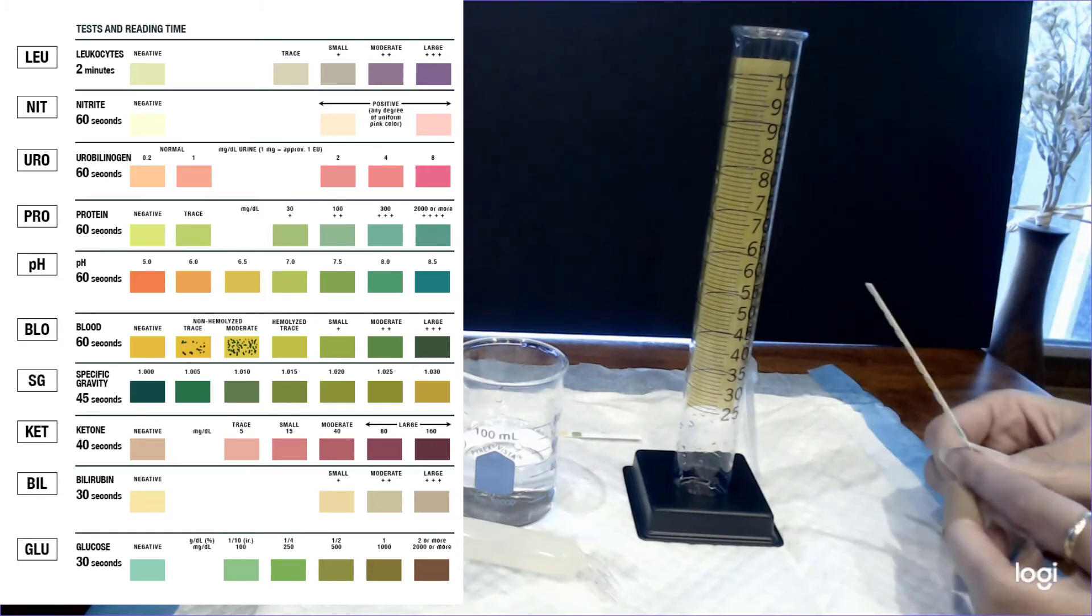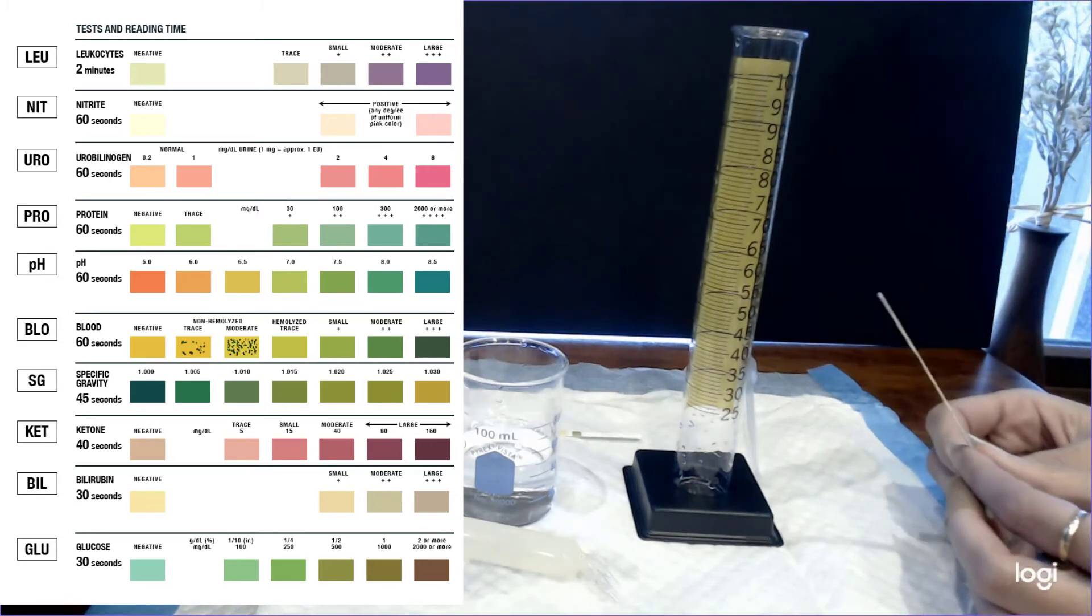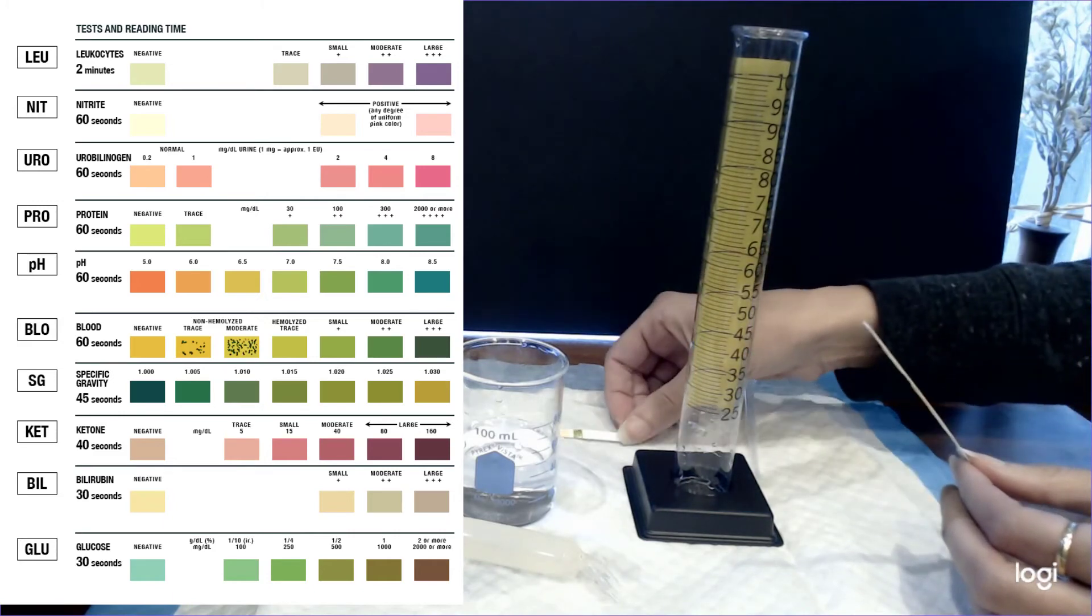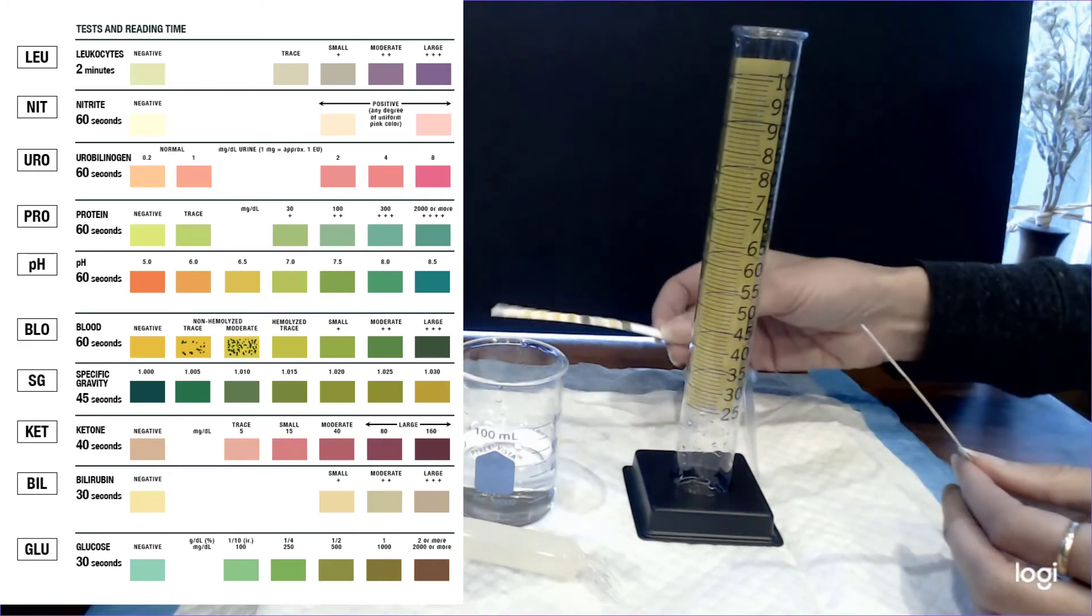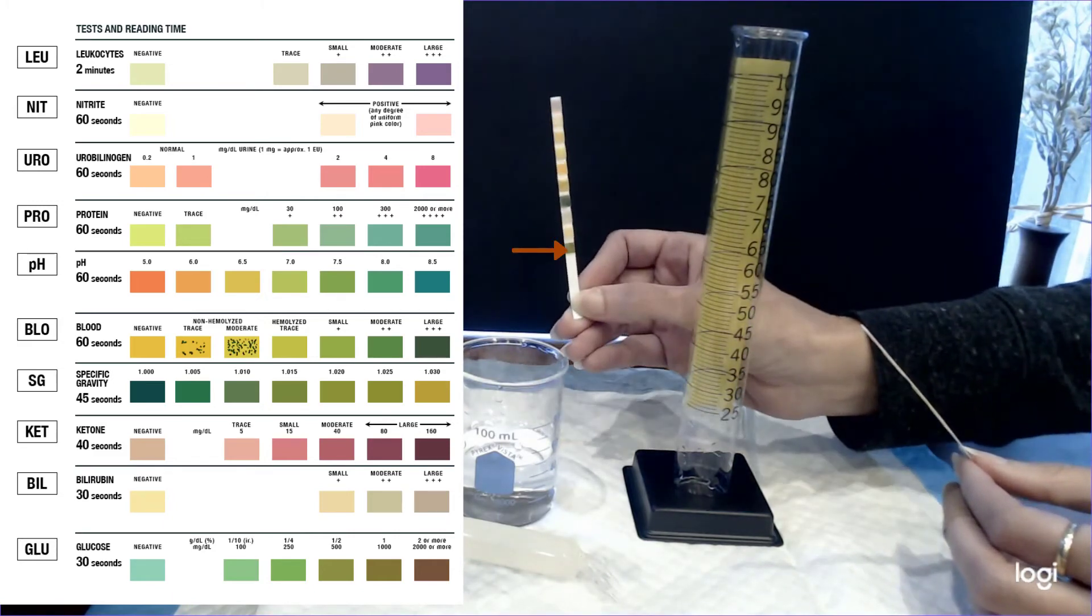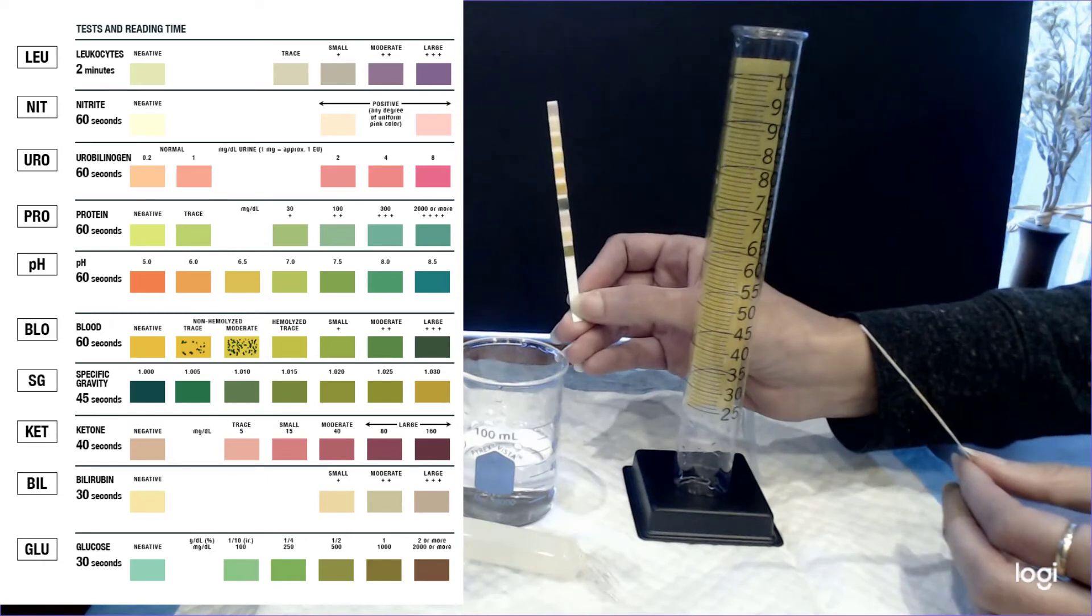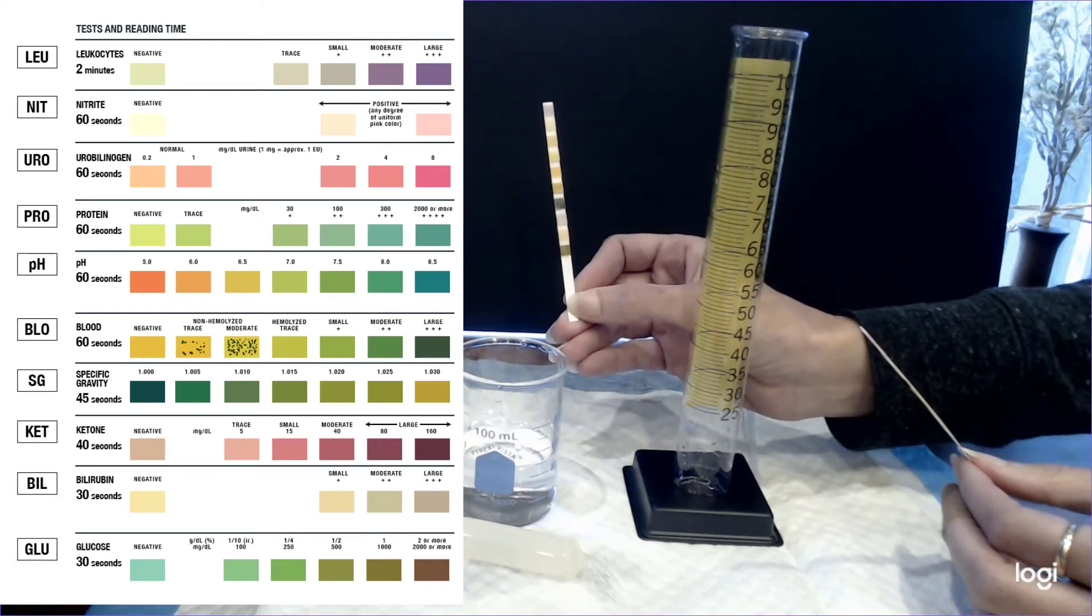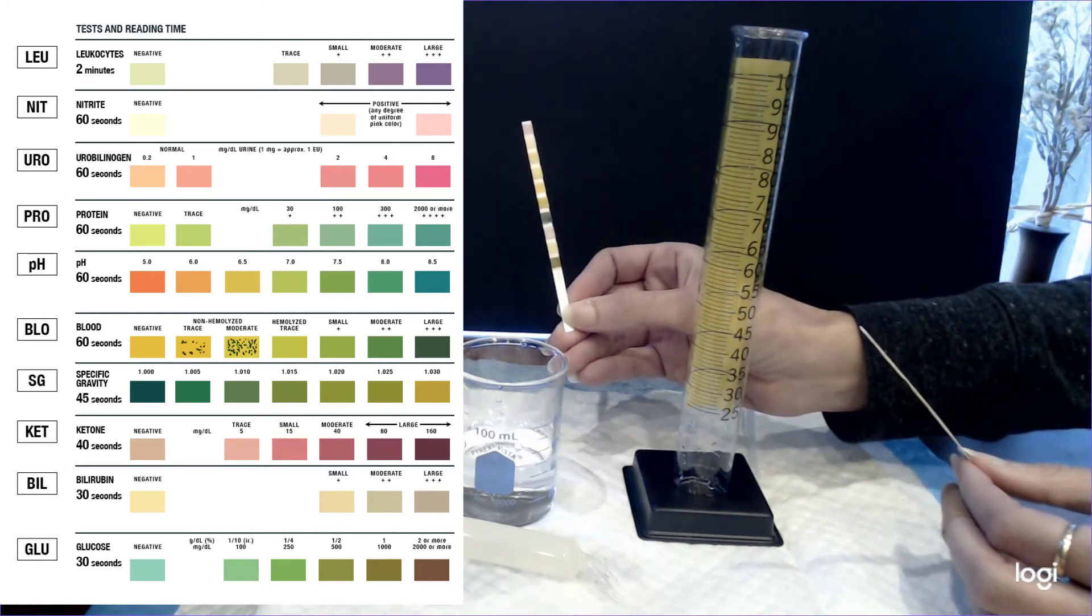The urine dipsticks have ten different things they assess for but the only two that we care about right now are glucose, which is down at the very bottom, and proteins, which are fourth from the top. So after you wait 30 to 60 seconds you can go ahead and compare the color on those pads, which are shown with the brown arrows, against the key which is shown here, and this will allow you to determine if there is glucose and or protein in the solution that surrounded the dialysis bag.